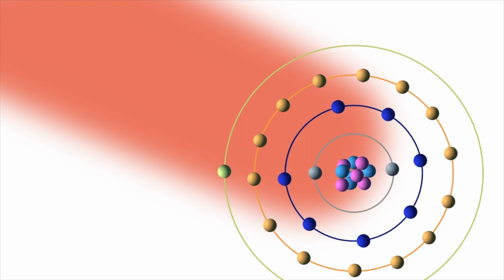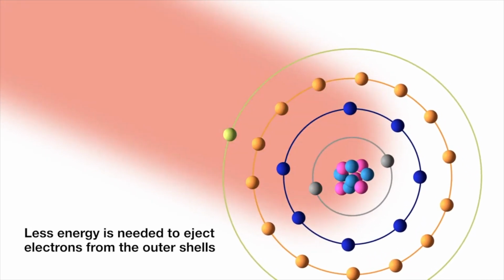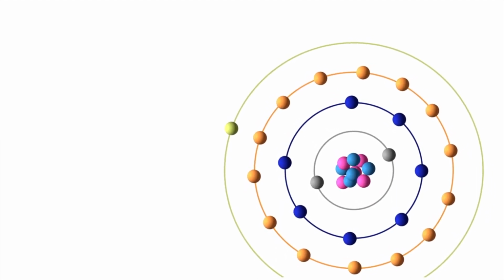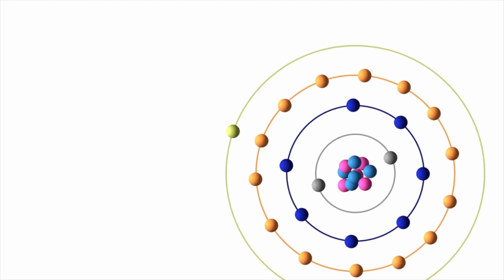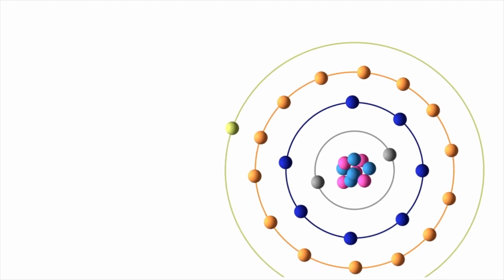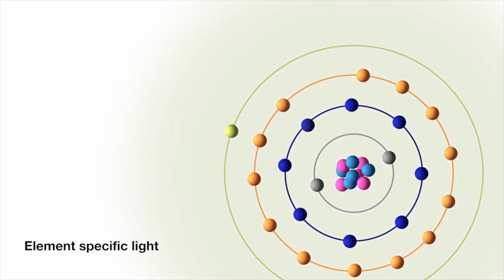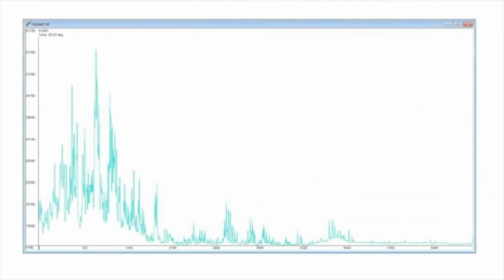During this time, the plasma emits a continuum radiation which does not contain any useful information about the material. When the laser pulse terminates, the plasma starts to cool until it reaches temperatures between 5,000 and 20,000 degrees Kelvin. During this cooling process, the electrons of the atoms and the ions in the excited electronic states fall down into ground states, causing the plasma to emit light with discrete spectral peaks. This way, each element in the periodic table is associated with a unique LIBS spectral peak.